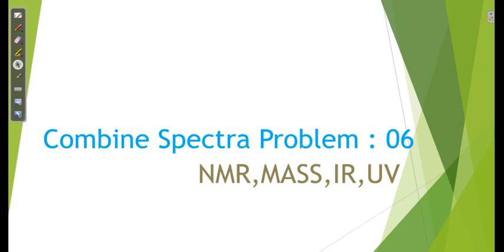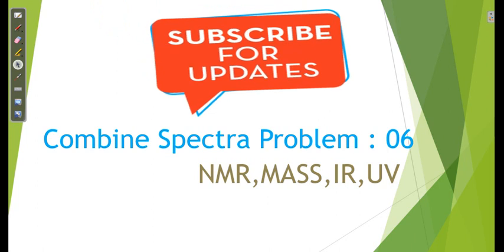Dear learner, let's start our continuous combined spectra problem analysis, and we reach problem number 6. Today we do not have the molecular weight, but we have a direct molecular formula, so the job is a little easier, but something is exciting in that also, which we will see in a continuous learning process.